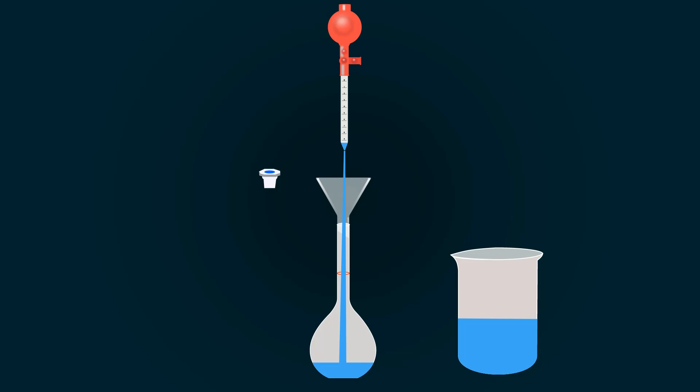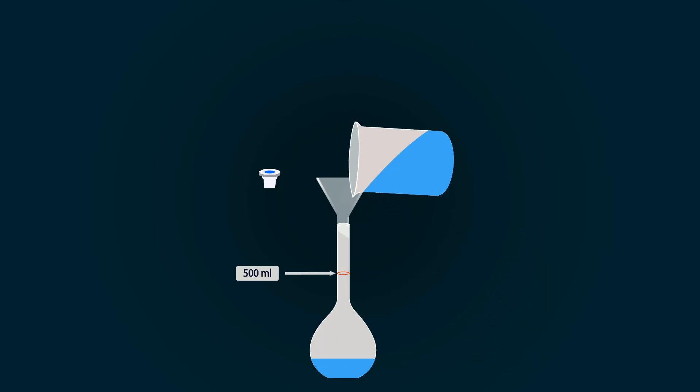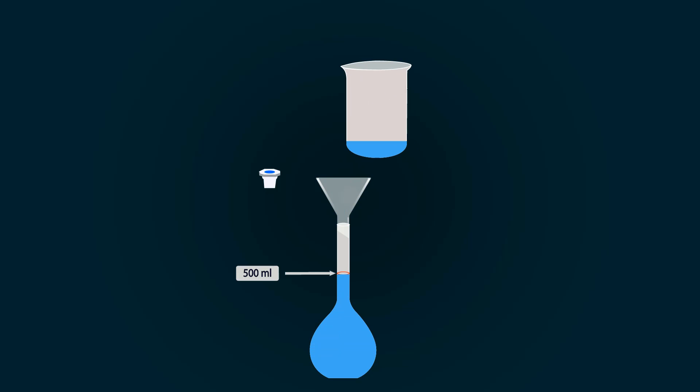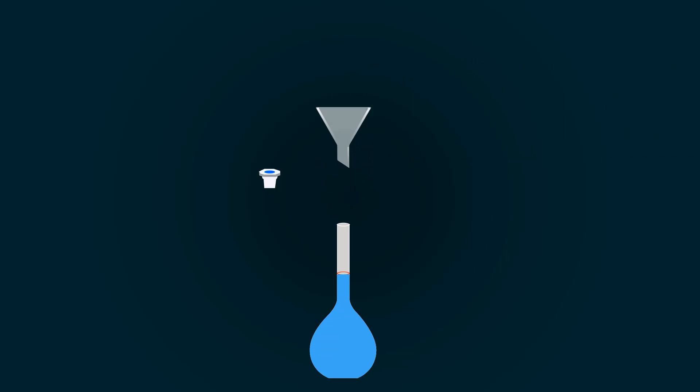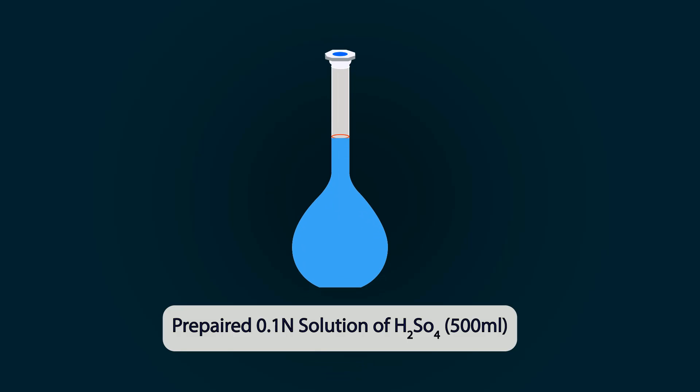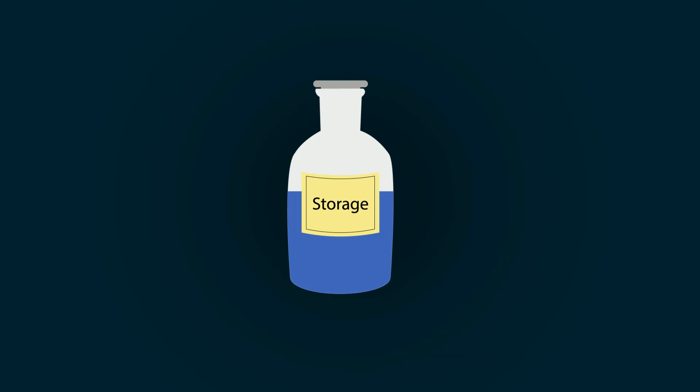As you can see, there is a mark indicating 500 milliliter. Fill with distilled water up to this mark. You have now successfully prepared 0.1 normal solution of H2SO4 up to 500 milliliters. You can store it in any bottle. Thank you.